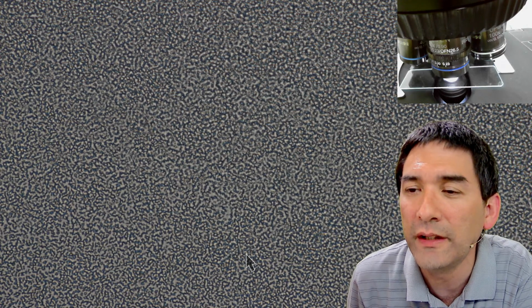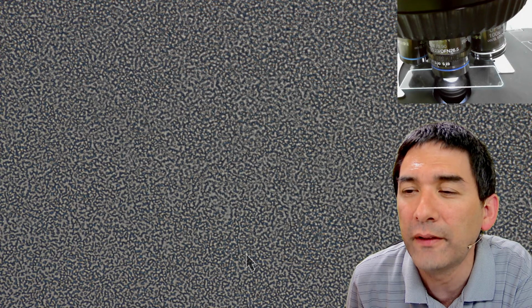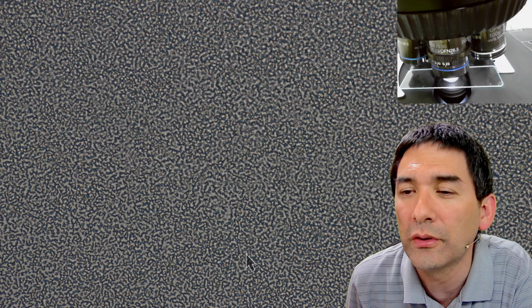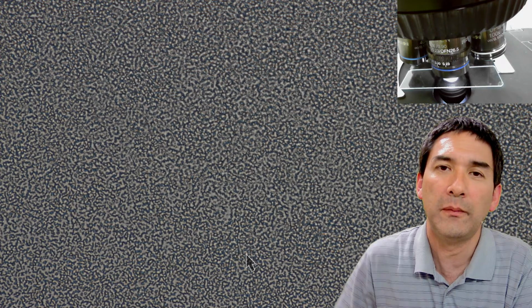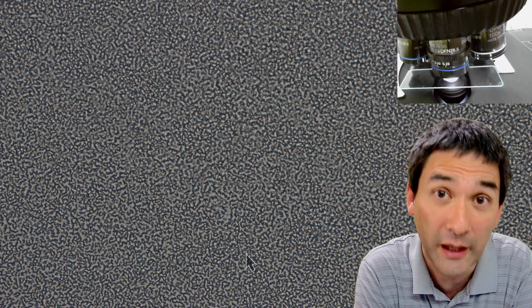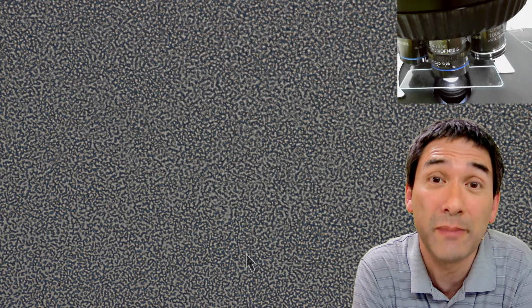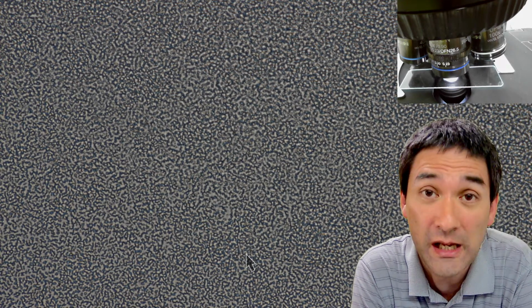Do you have any recommendations for microscope ergonomics? I have a neck hernia, and I'm planning a major which requires me to use microscopes a lot. Well, I can tell you the following. Microscope ergonomics matters especially when you're looking through a microscope for a very long time. Some doctors and researchers spend 8 hours a day behind the microscope.